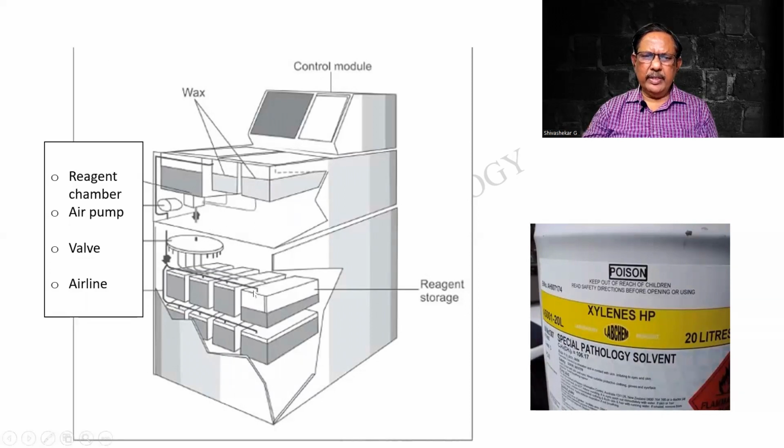And I find that these are all the various reagent storing ones. So, and there is an air pump which will be operating it. So this is important. I have just shown xylene as one. We will have to take the precautions about the specificity of the reagent that is required and procure it from a good quality company. We should not compromise with it at all because it will reflect on the processing of the tissue as I will be showing you in a few examples.